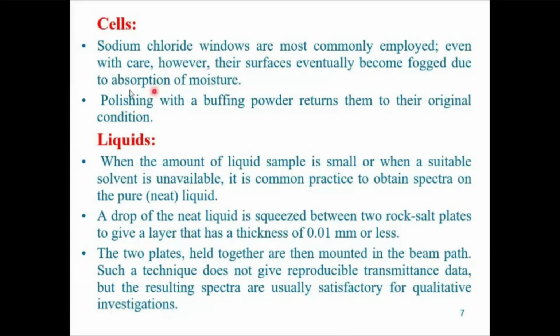Polishing with buffing powder returns them to their original condition. So they have to be polished frequently to maintain their optical characteristics.